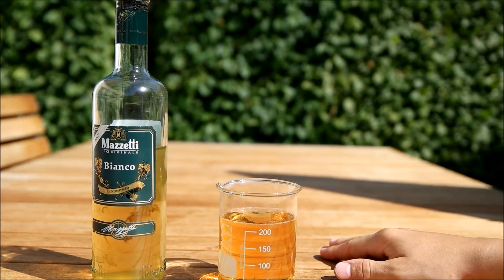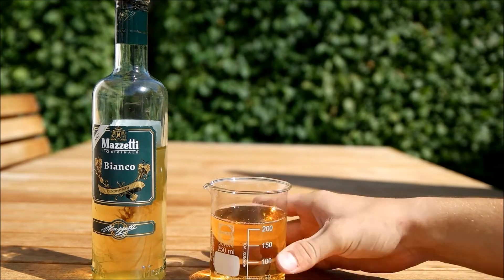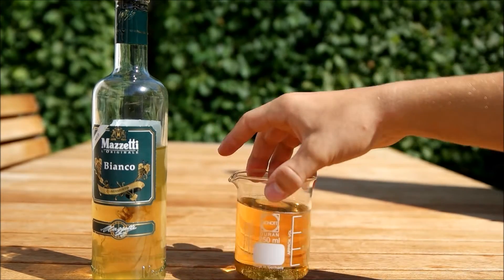Put the drops on a Bromothymol Blue Agar plate, which I'll show you later how to make. It should indicate an acid, which in turn indicates Acetobacter bacteria.